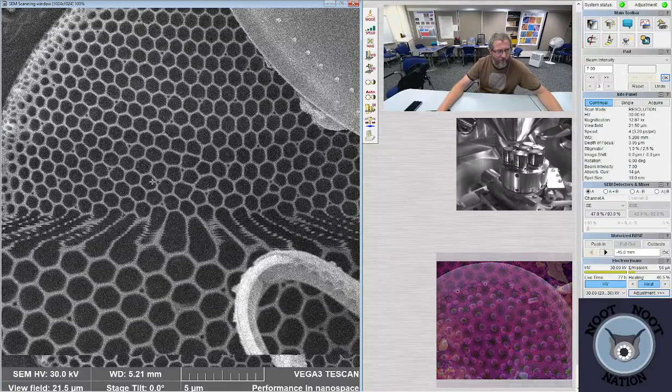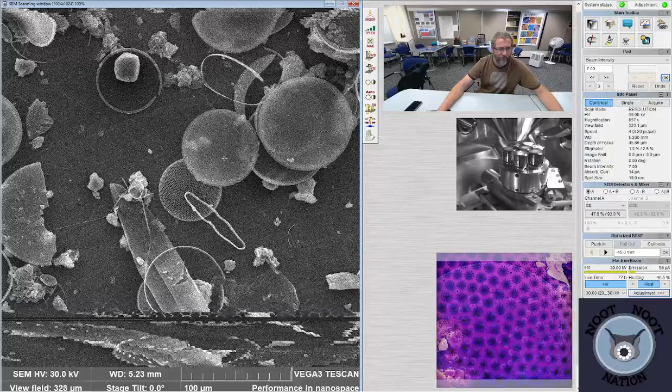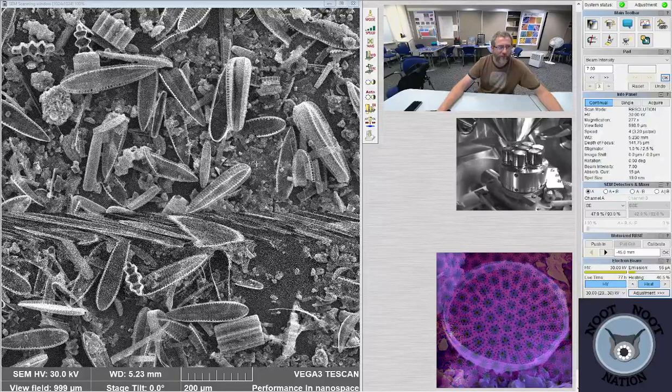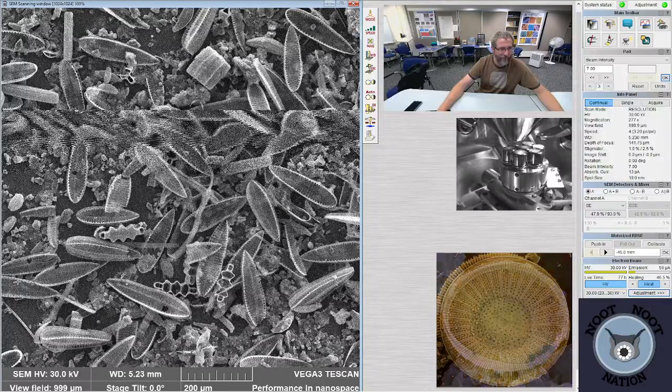Let's go look at the Mountain Lake sample after I made fun of the name. And we can check out some freshwater diatoms. Bloop. I think it's this one. Oh. So here we are. We're no longer in the round diatom realm. This sample is full of Cymbella. That's a lot of Cymbella.